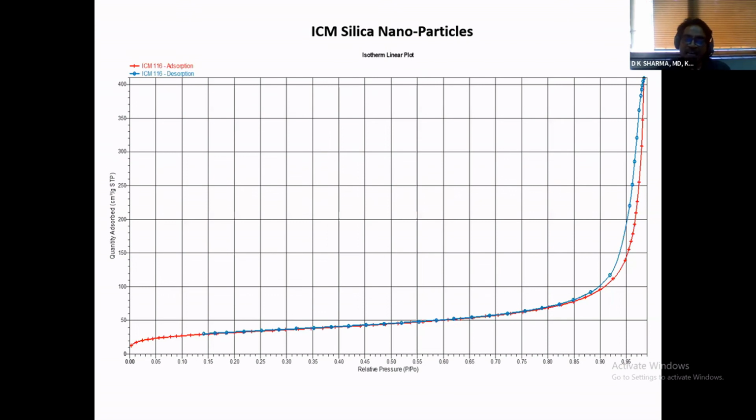And normally, no matter what size, whenever you put spheres together, they will always have a void space. Okay, the size of the void space, which is basically what these pores are, depends on the size of those spheres. When it's nanoparticle, the size is very, very small.